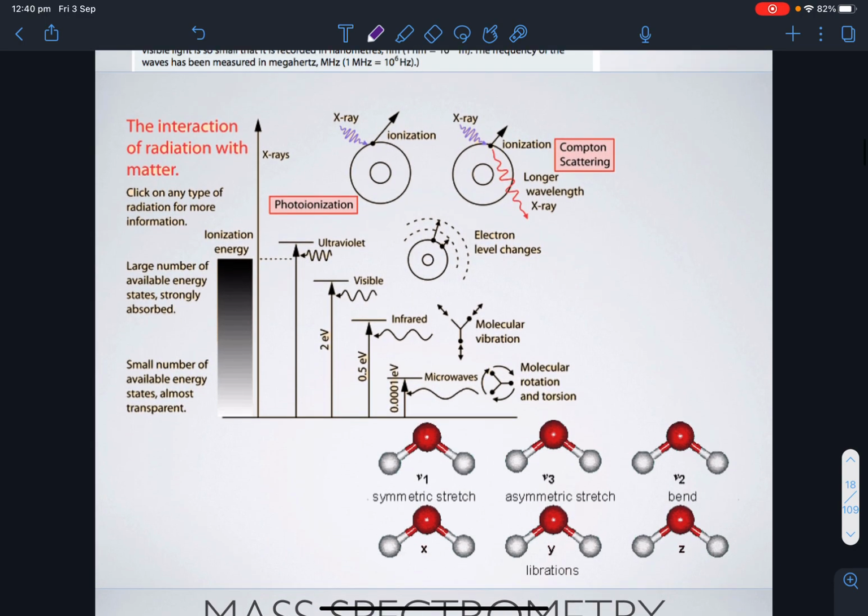Okay, so here's a nice diagram and reminder, except the animation doesn't work in a PDF here, of what happens to molecules and how they interact. So on our little graph here, the y-axis is different energies, and what they're trying to show is what different forms of energy do to molecules.